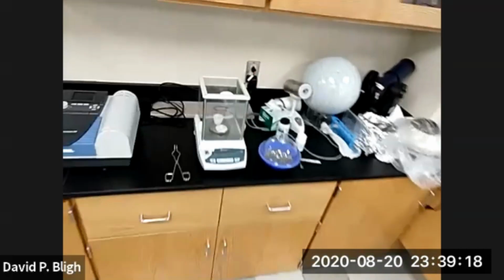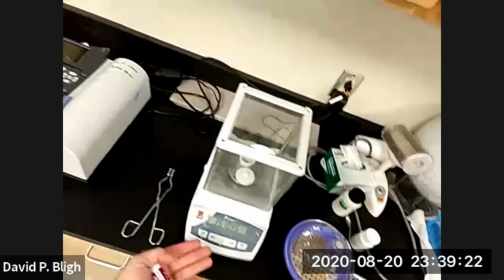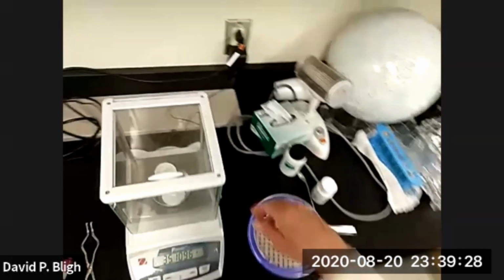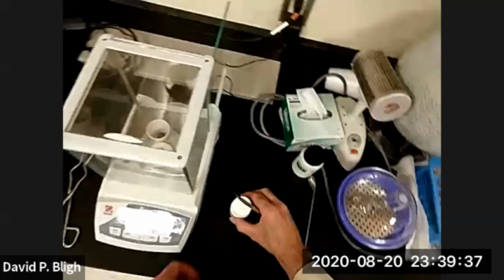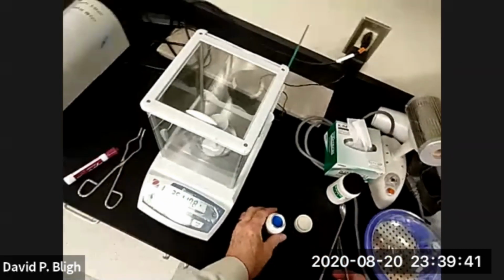So what would 1.9 added to this value be? It would be about 37. About 37 grams will be the value we're shooting for. So let's set this aside, and let's try to make 37 grams.